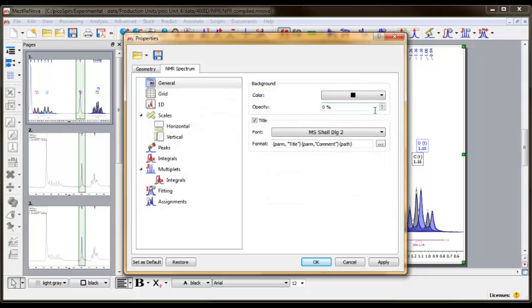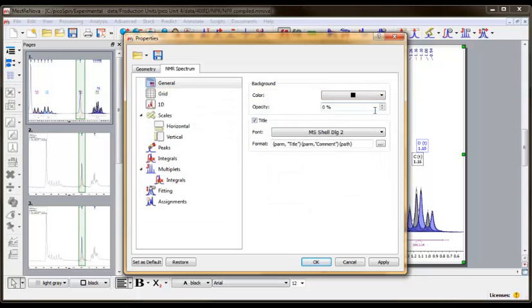Back in the Properties window, uncheck the Title box. If this remains checked, then the dataset name and file path will be written on the spectrum in the main workspace.